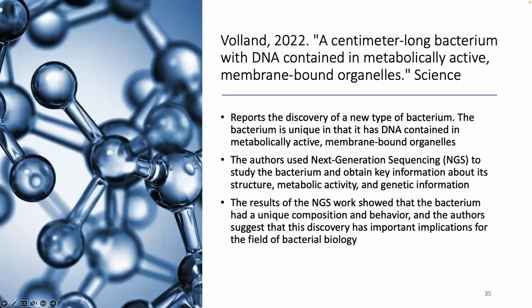Now, I mentioned a case study. We have this paper by Volland et al. These researchers sought to characterize a very unique bacteria. This bacteria grows to about a centimeter long, which most bacteria are 5 to 10 microns, right? So we actually have something that you could almost pick up and look at, and it's a bacterium. But with such an odd find, they imagined that there might be some peculiarities in the genome. And so how do you go about characterizing an organism like this that is so far from the ordinary?